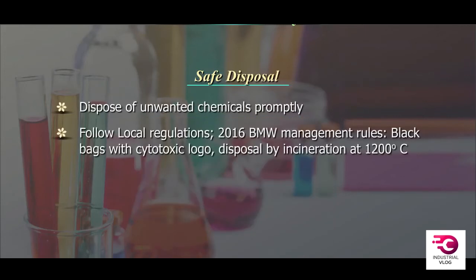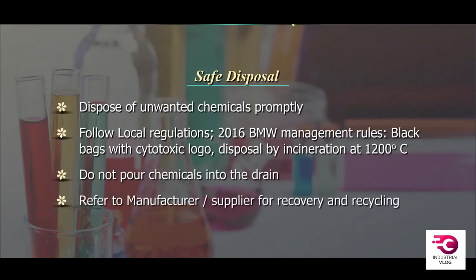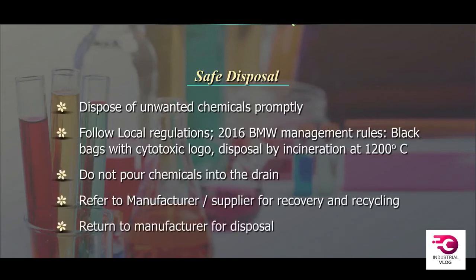Follow local regulations. The 2016 BMW Management Rules. Black bags with cytotoxic logo. Disposal by incineration at 1200 degrees centigrade. Do not pour chemicals into the drain. Refer to manufacturer or supplier for recovery and recycling. Return to manufacturer for disposal.